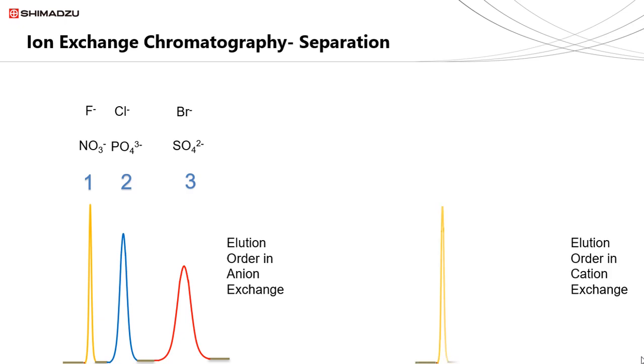Studying the cation exchange creates separation of positively charged ions. Separation follows the same rules as the anion.